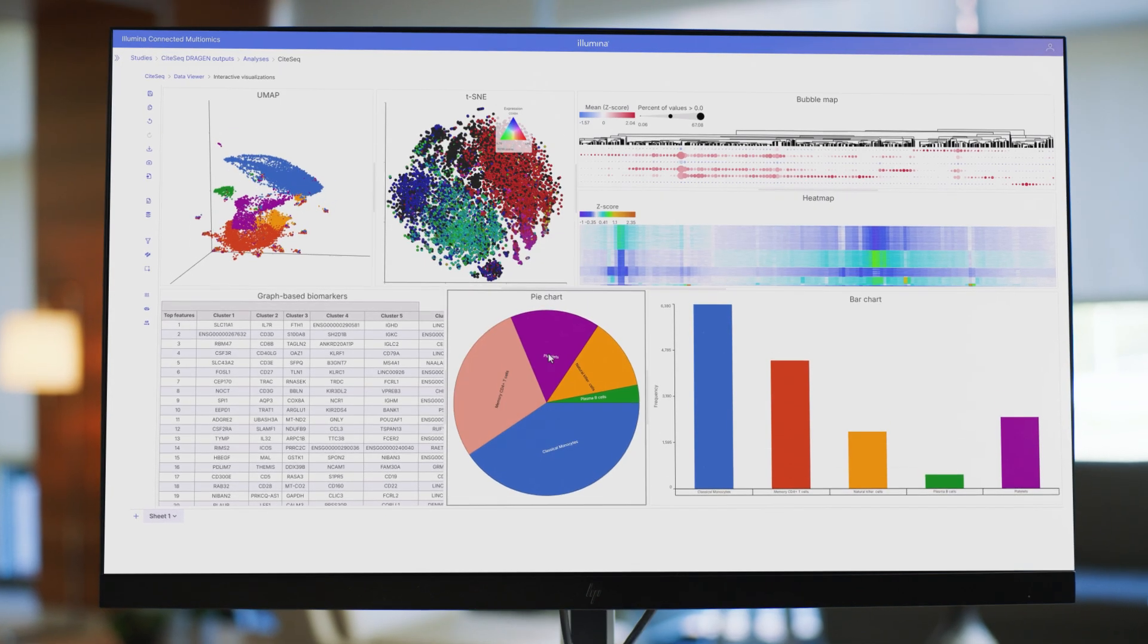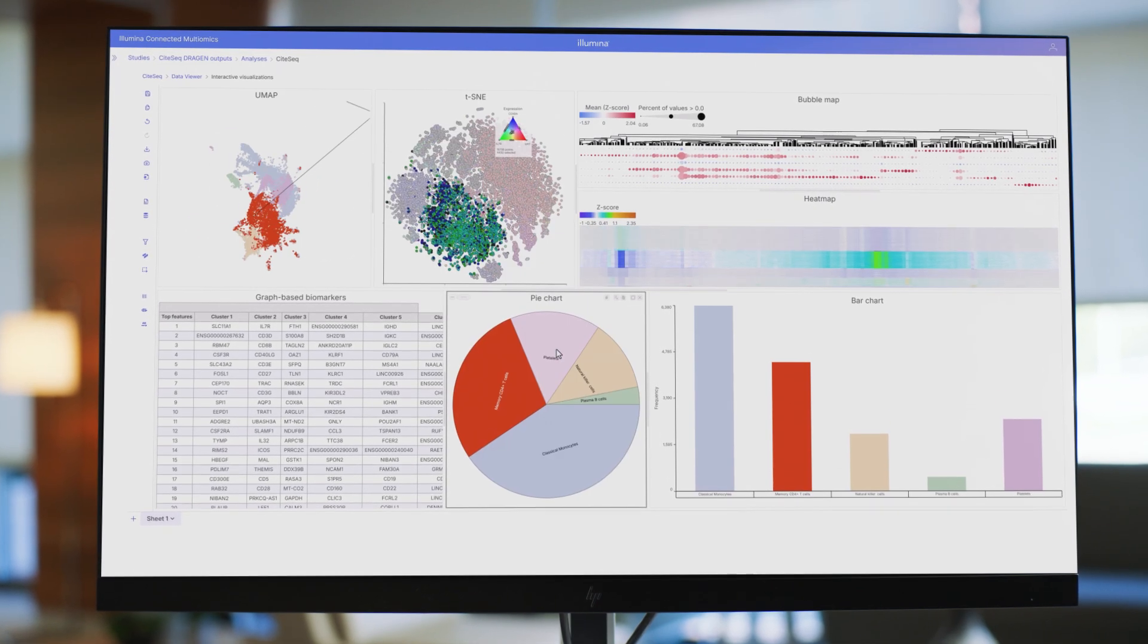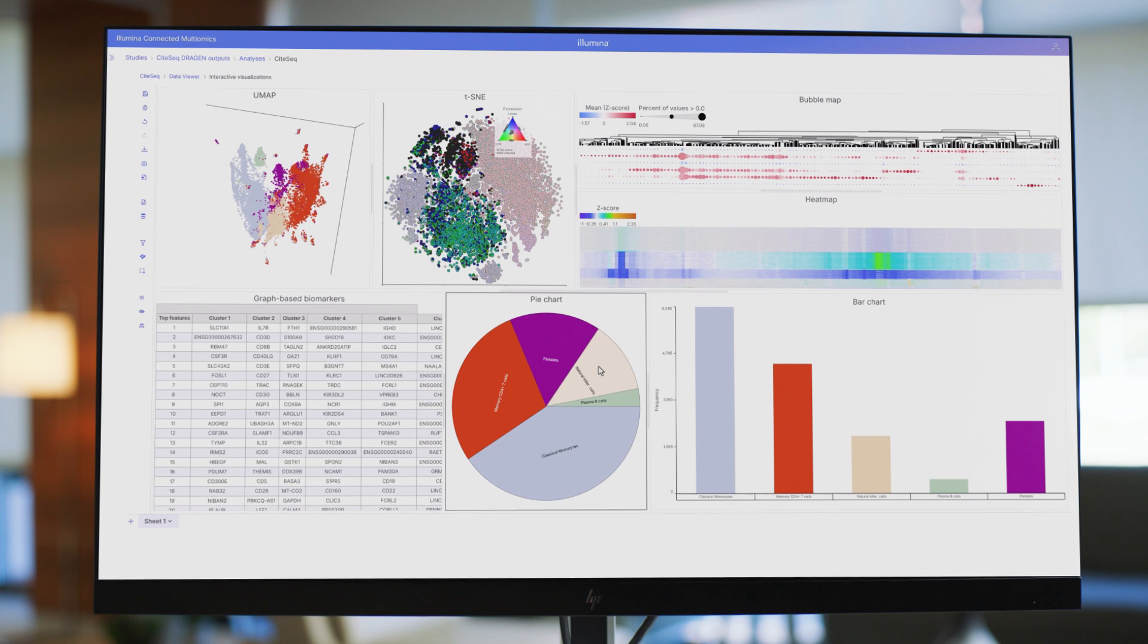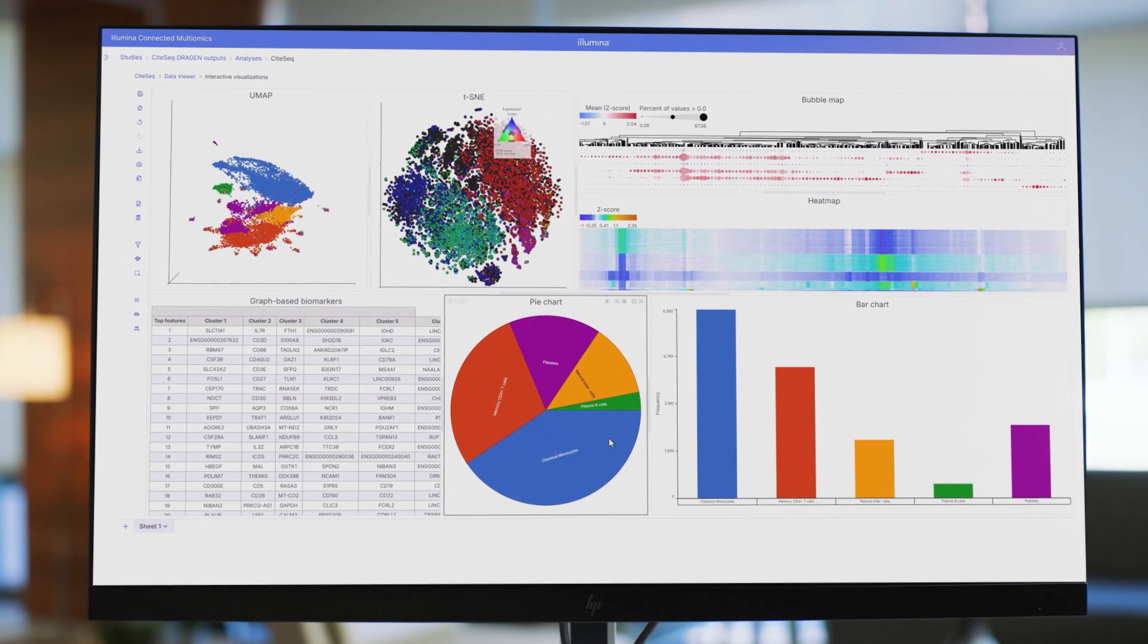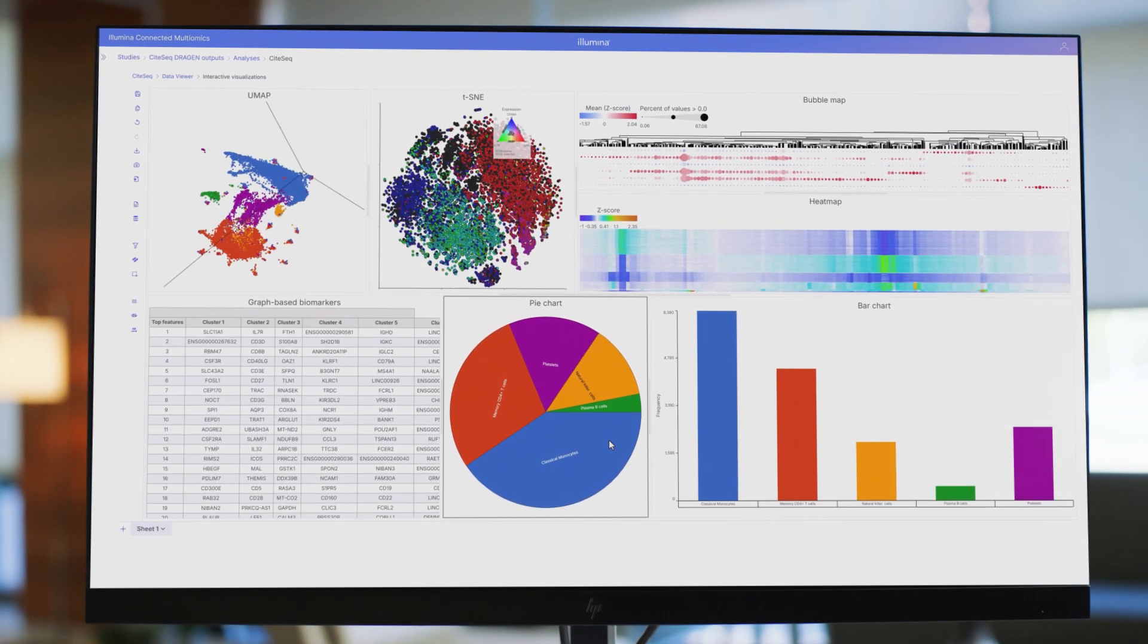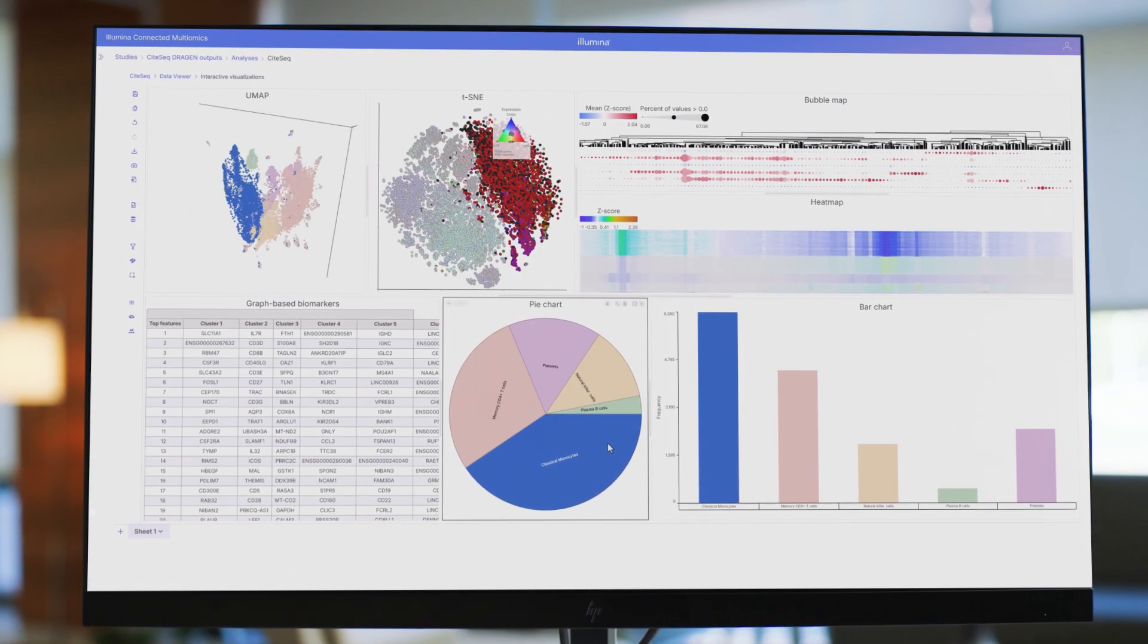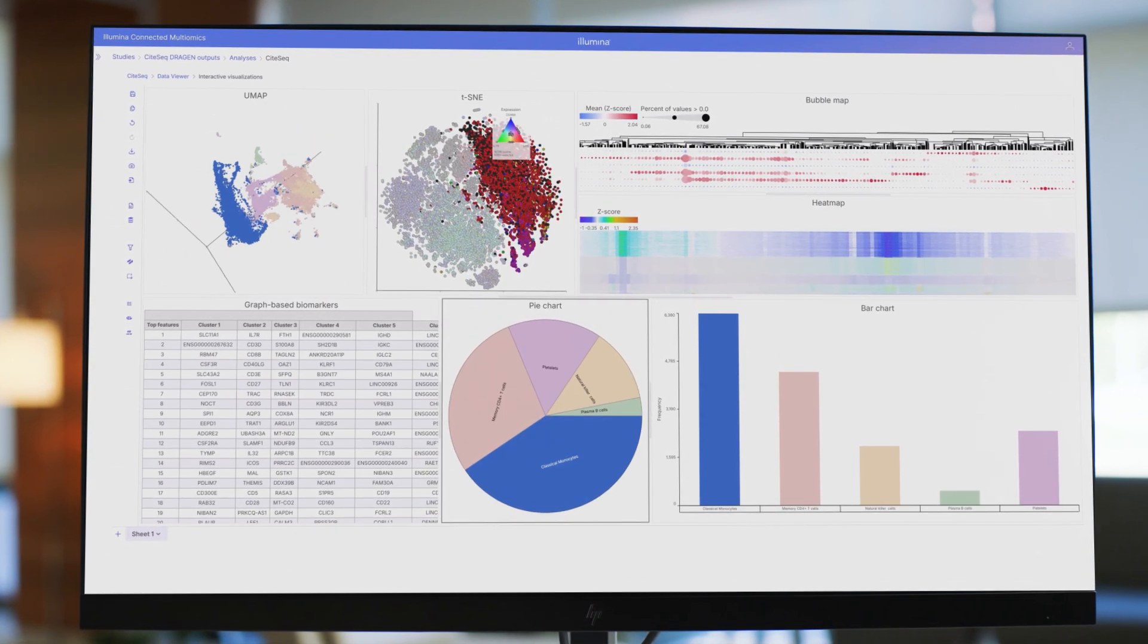Using a wide variety of plots, meaningful patterns, biomarkers, and pathways come to life to tell the biological story in my data.